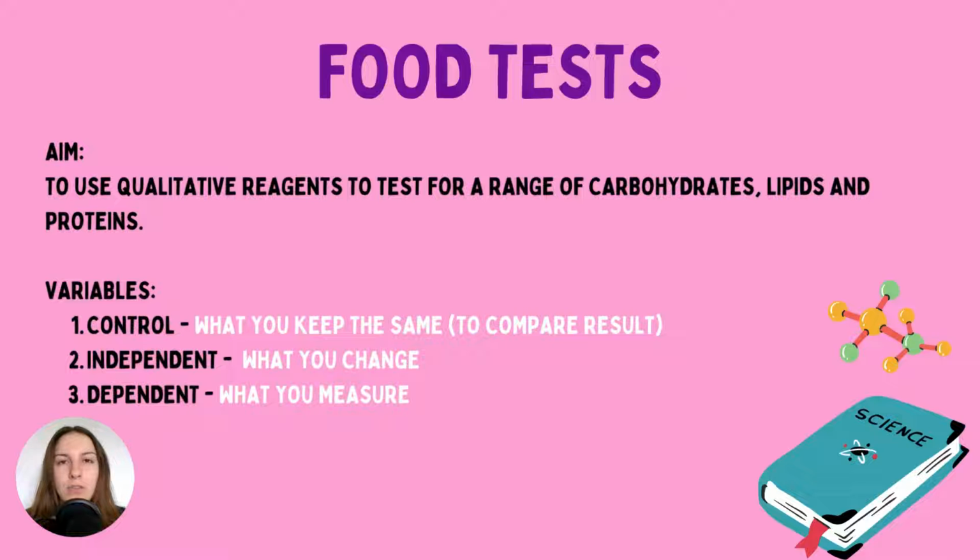Unlike other practicals where you're actually quantifying your results, using data and graphical analysis, you're using a subjective analysis. You're determining whether there is something present, yes or no, based on a color change, something that you observe, which can actually be helpful, but it can be subjective, like I say. So some people may think, oh, that's green, and someone might think, I think it's more blue, and that can change the dynamic of the answer. And that's one of the pitfalls of this practical. So it's something to be aware of.